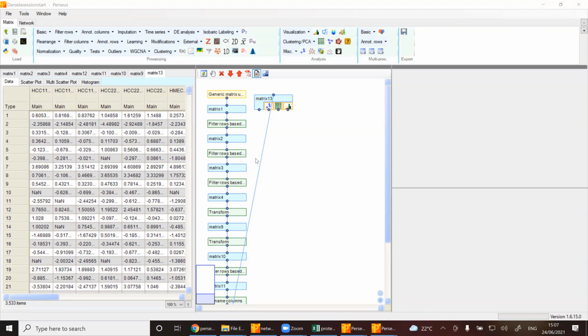Maybe they did something wrong. Probably yes. Maybe what I can do is explain what you need to select in MaxQuant. Basically, in the group specific parameters, in the normalization section, you need to select the weighted ratio, so that MaxQuant will select your reference channel and then apply the weighted ratio to all the other channels. But at the same time, you need to tell MaxQuant which is the reference channel.